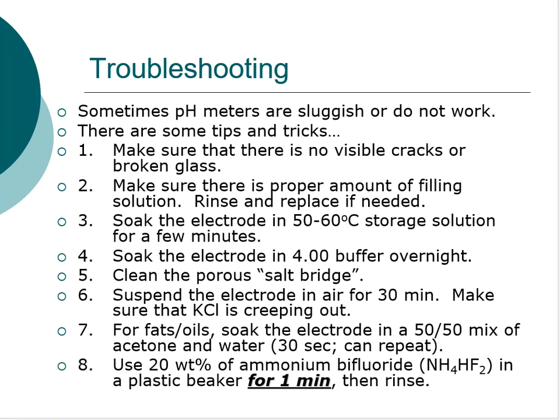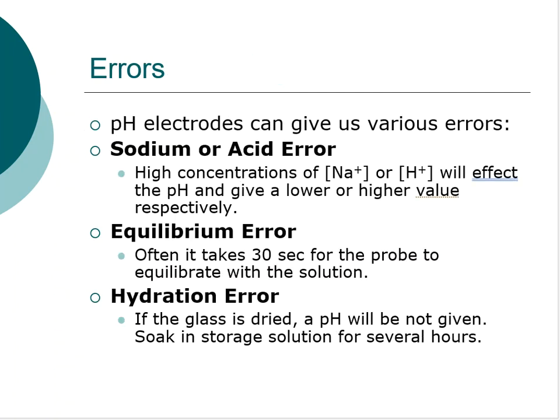In the last video we talked about being up the creek without a paddle, hoping our pH probes could be our paddles in pH theory. Now we need to talk about some extra problems that can happen if we're not careful when using a pH probe. There are three major ones: the sodium or acid error, the equilibrium error, and the hydration error.